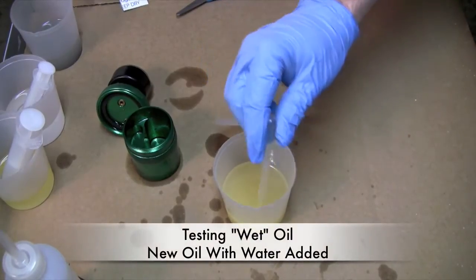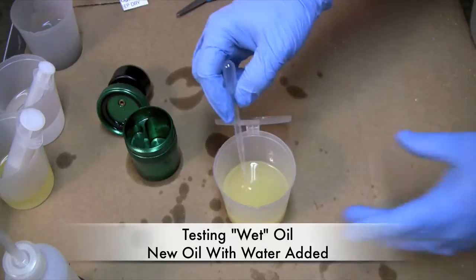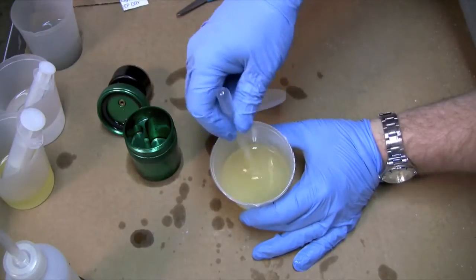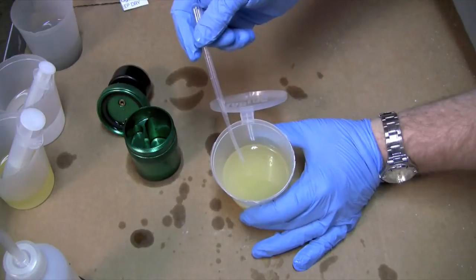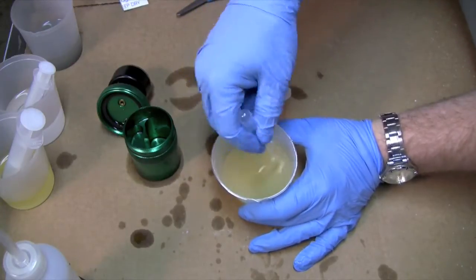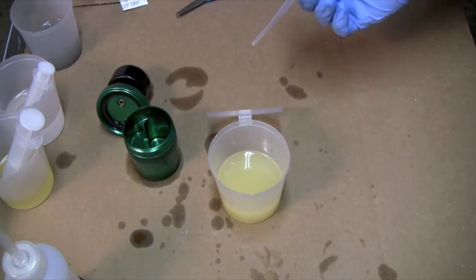The next sample we're going to do: I took some new oil and mixed in some water. I didn't really measure how much, so I don't know the exact content. But you can see that this oil is cloudy. If you go to a restaurant and pull some oil out of a bin and bring it home, cloudiness in oil is one indication of water. It's not the only indicator — it could be lard or other things — but this creaminess to the oil typically can indicate the presence of water. So this is the sample we'll be using for the second test.